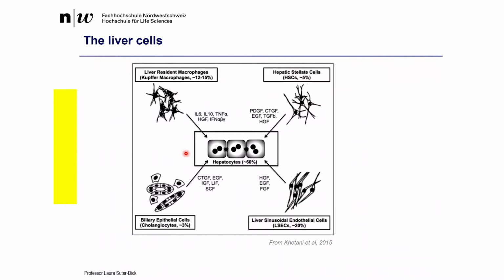The biliary epithelial cells or cholangiocytes, and these cells can be generated from the HepaRG. The HepaRG is normally differentiated into hepatocytes. They can also be differentiated into cholangiocytes. That's very important in the liver for the liver function and the responses to toxicants, for example. In disease.